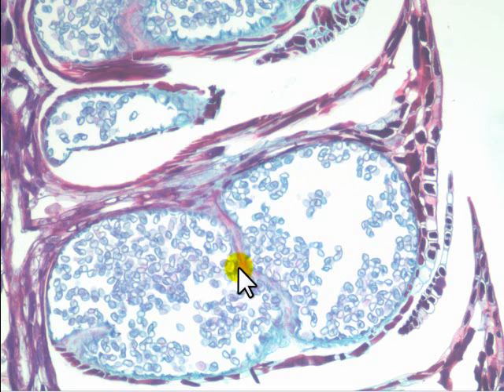Yes, we do. And I picked this one because you can see parts of both sporangia. How'd that happen, Professor? Well, if you cut it at a certain angle, you get to see both. I didn't make this slide, but whoever made it happened to catch this particular microsporophyll at an angle showing both microsporangia.